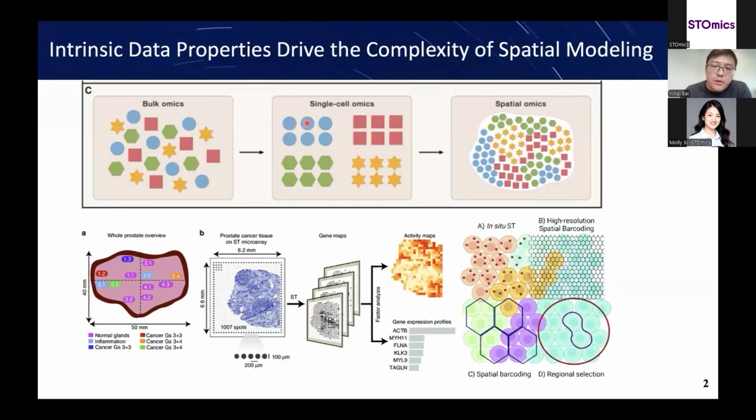So for each population, we have many biological replicates, or we call cells, and the comparison is based on what I said, 2,000 or 3,000 dimensional data. So this analysis, because we have more samples, becomes robust.